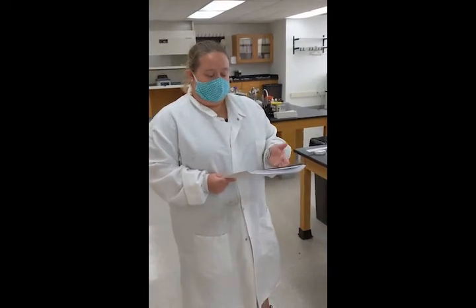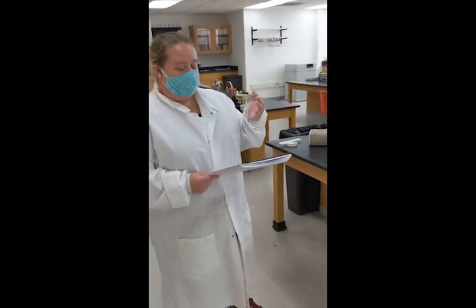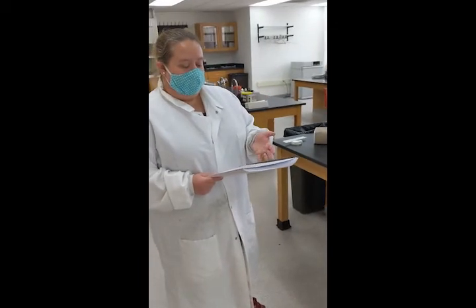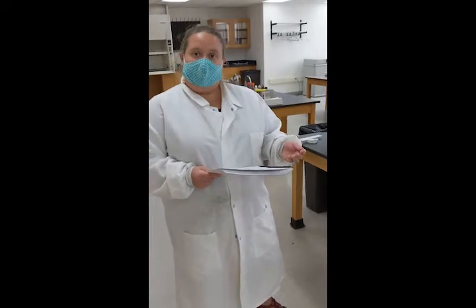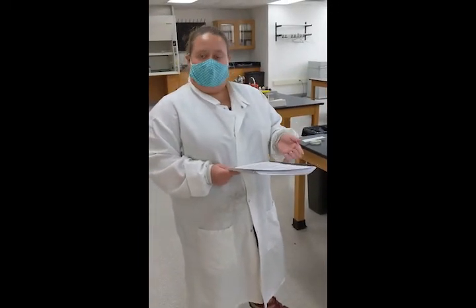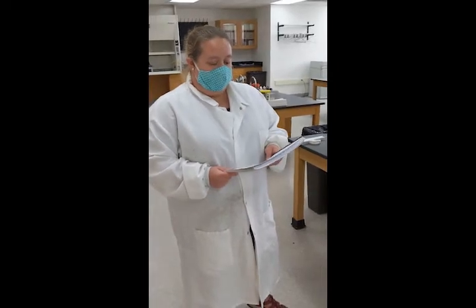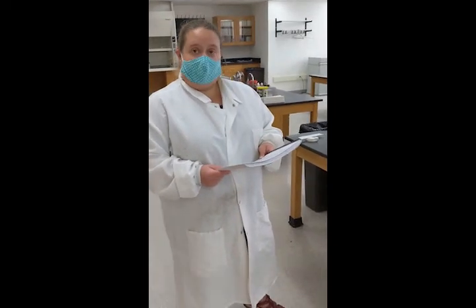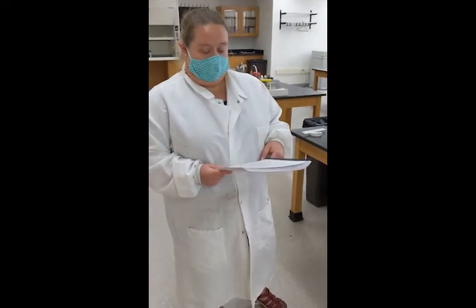When we work with microscopes, we're going to be making slides. These slides need to be cleaned properly — what we do is dunk them in bleach, then clean them with a detergent, and then you can reuse your slides. Just make sure that if you are disposing of any contaminated glassware, it is disposed of in the proper container.